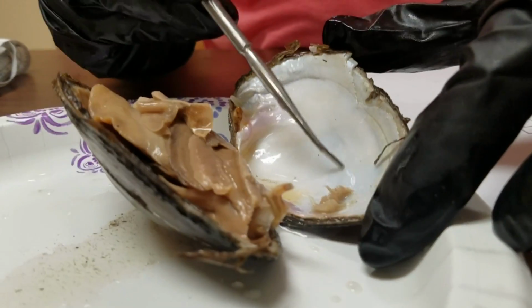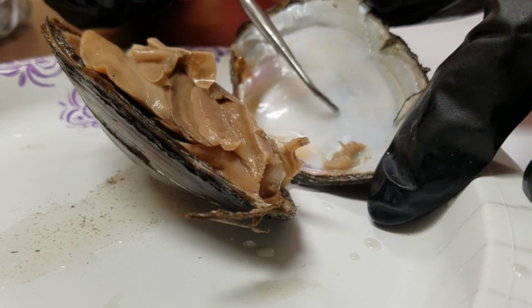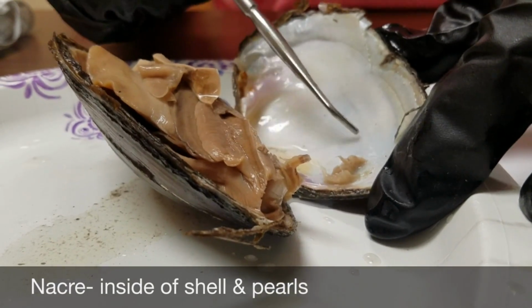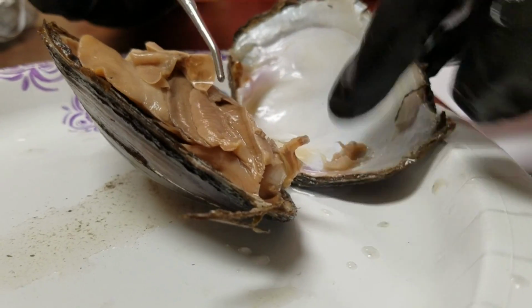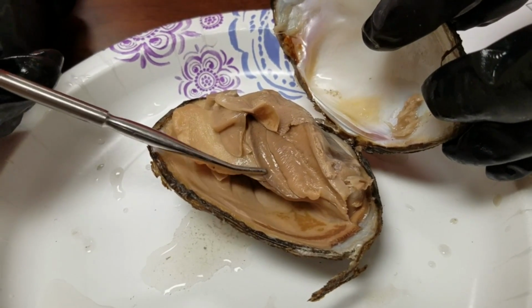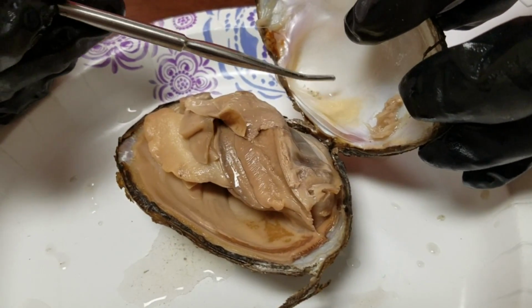And you can see that on the inside of the clam, it's real shiny, and if you run your probe over it, it's very smooth, it's real iridescent. This stuff is called nacre, N-A-C-R-E. So nacre is what the shell is made of. This is what pearls are made of too. So the reason that you have nacre inside the shell is because it's real smooth and real lovely feeling. Because if you look at his body, or her body, it's very soft, and so it doesn't want to be scratched or anything like that. That's why they make pearls. If there's sand that gets in there, they're going to excrete some of this nacre onto it to make it smoother and softer, and not be an irritant to them.